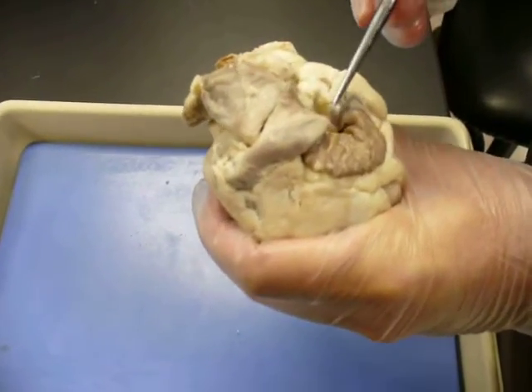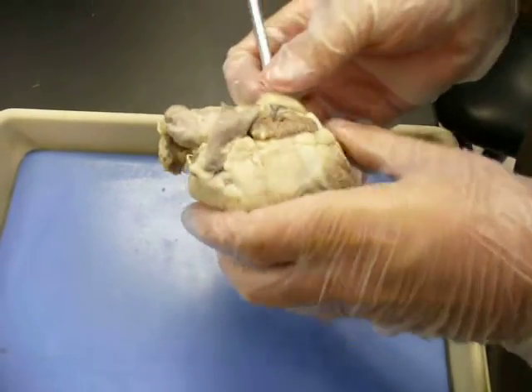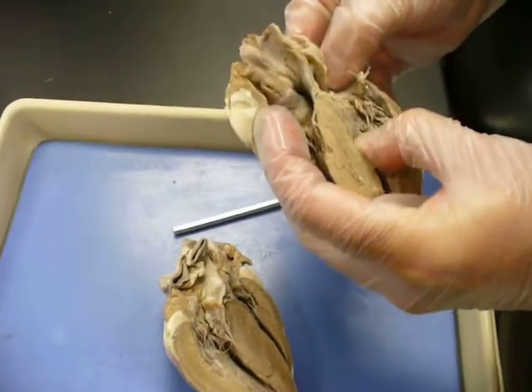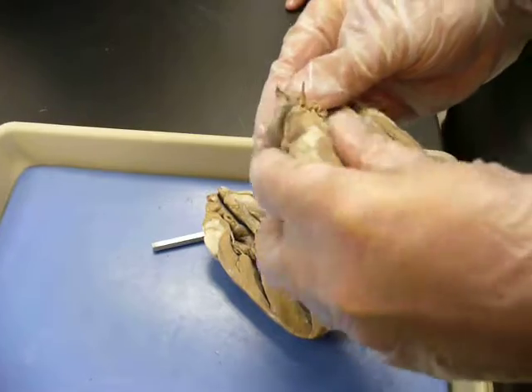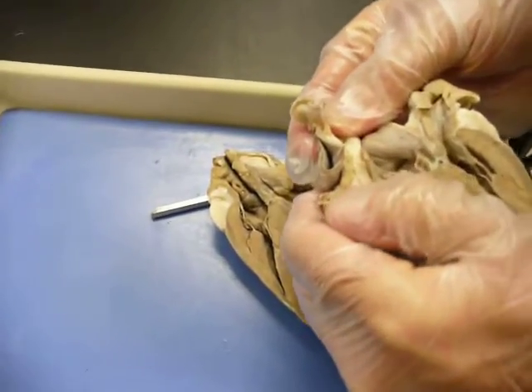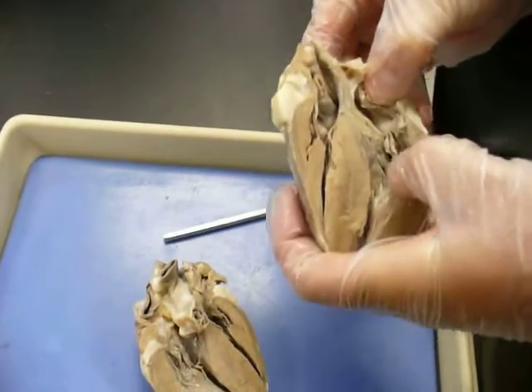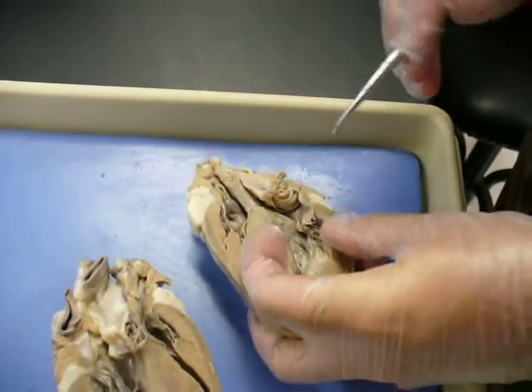Blood comes back and your pulmonary veins are going to empty in — there's one right there. This is your left auricle right there. If I open it just like a book, you can see the pulmonary vein coming right down through here. That's going to be your left atrium, right inside here. Blood comes in, comes down through here, and it's going to come down through the mitral valve — or bicuspid valve.